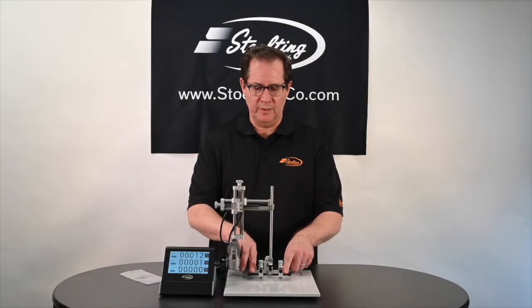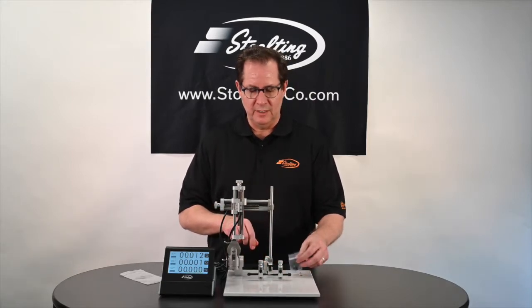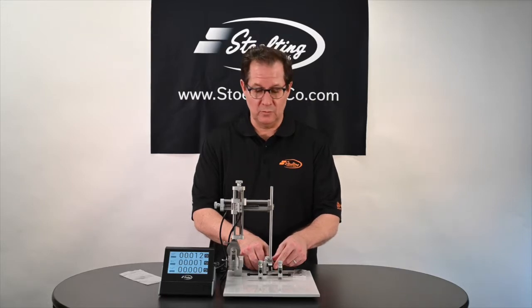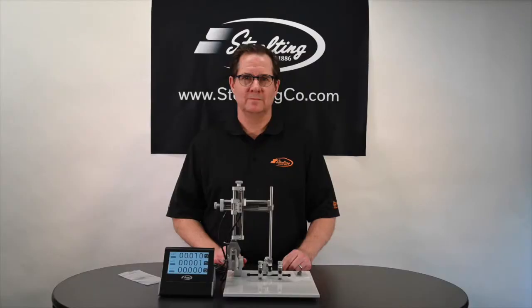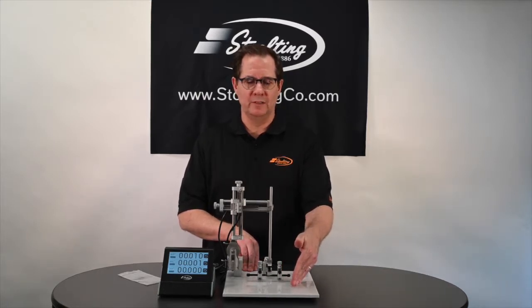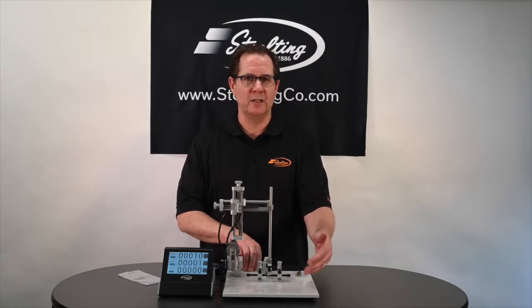What's included with the ear bars are the rubber tips, the traditional insertion into the animal's auditory canals, as well as the jaw cuffs — a jaw cuff for the zygomatic process of the jaw of the mouse or just covering the ear. The snout clamp also comes with this system for holding the animal's head: you put the front incisor teeth in, lock them, and clamp over the head. This is good for when doing injectable anesthesia. Also included with all Stolting Stereotaxics now is our rodent warming base — you simply attach a cord to the bottom of the base and it will heat and maintain a certain level of heat for the animal to stay comfortable during surgery.